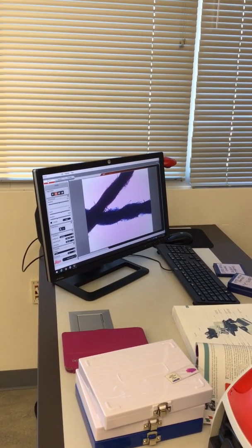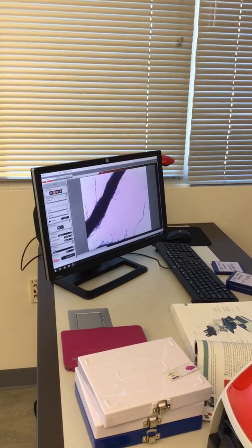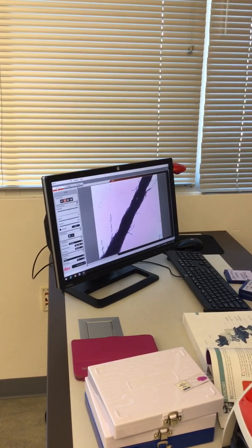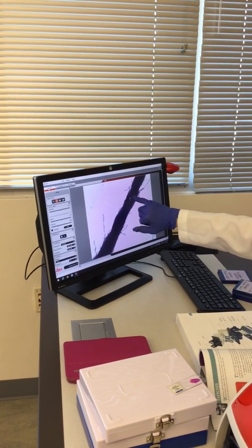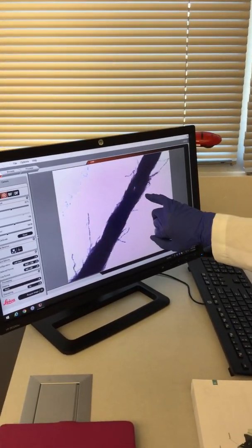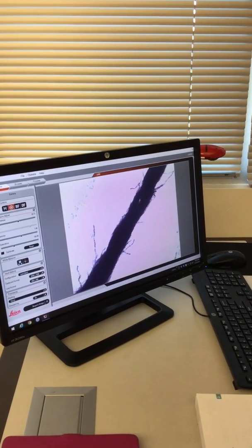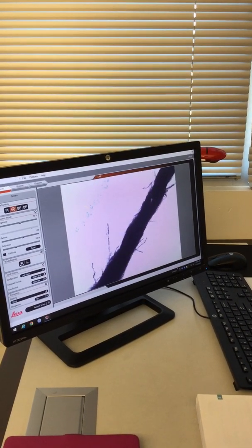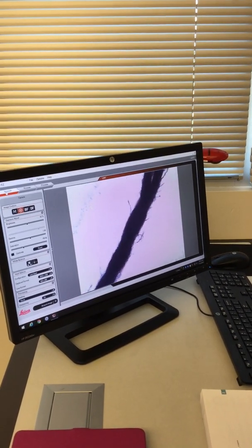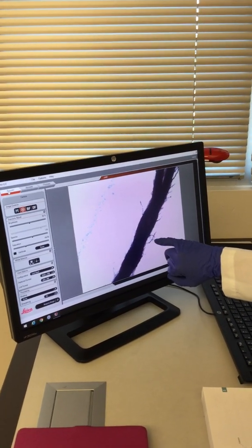It is not easy, because these ones are almost flat, but they're there, and they have a different level as well. See how in here it's a little bit out of focus, so let's see if we can focus it better. Now it looks better. Following it. In here, this area looks a little bit out of focus.